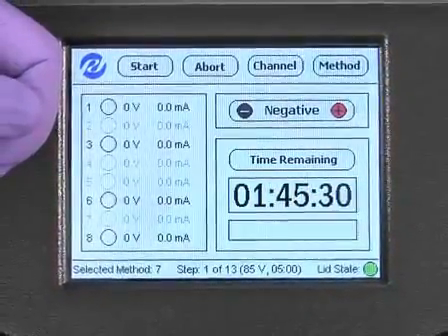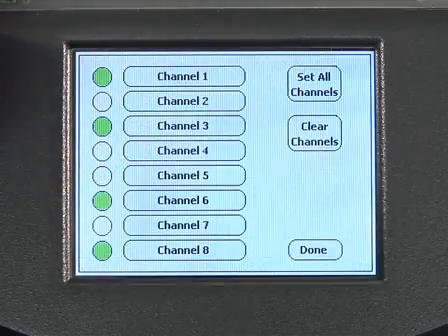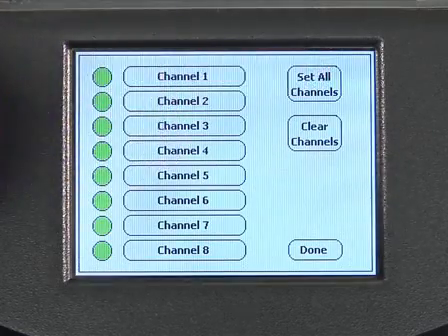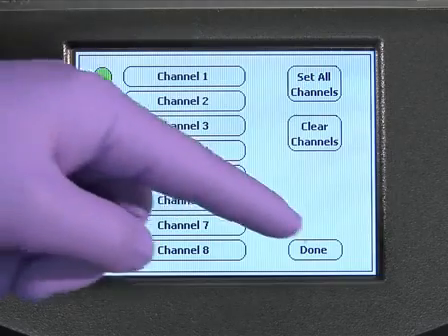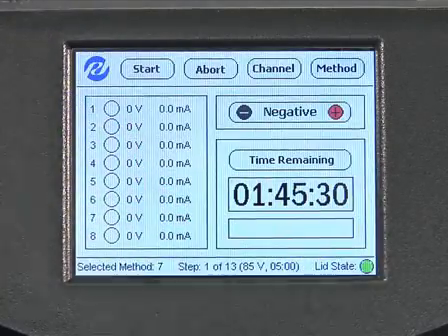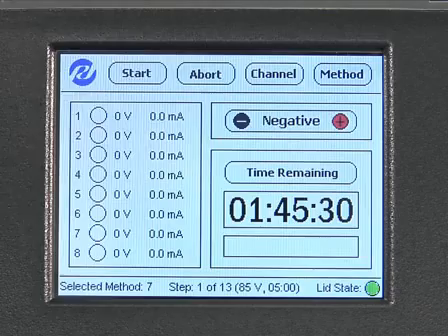Once the appropriate method has been selected, press the channel button on the main screen, then select the channels that will be used in the run. To select all eight channels, press select all, then press done to return to the main screen. Ensure that the safety lid is closed and that the indicator light is green at the bottom of the screen. Now press start to begin the experiment.